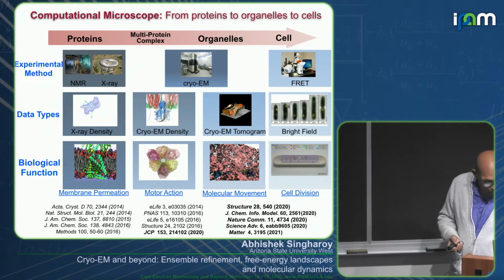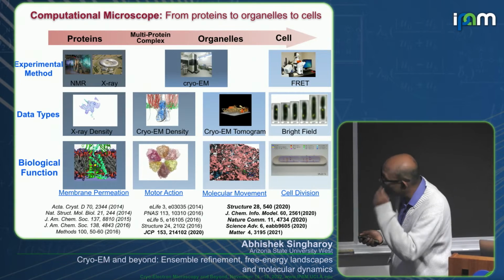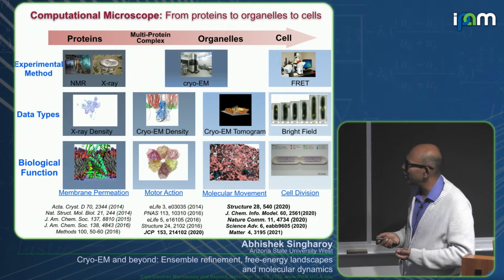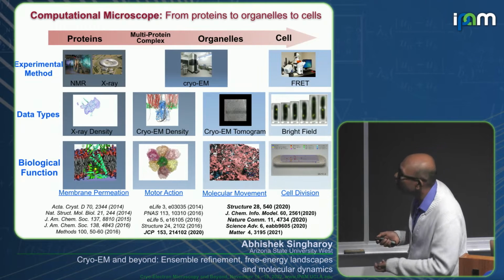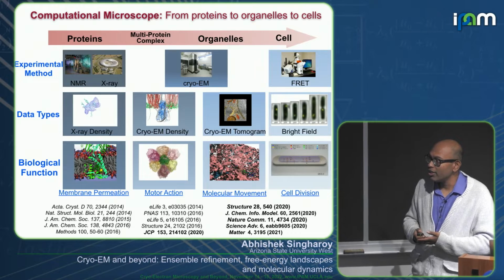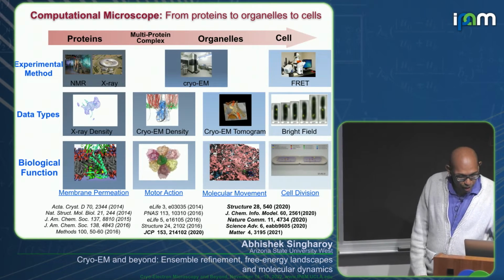Okay, so with that then, this is of course some of the things, and Cryo-EM is of course one of the data sets. I wanted to highlight that Cryo-EM is one of the data sets that is used in molecular dynamics. There are data sets of different kinds: X-ray crystallography, tomography, bright field imaging. NMR is not here, but molecular dynamics has this intersection with all these areas. And okay, so this is of course some of our work here.